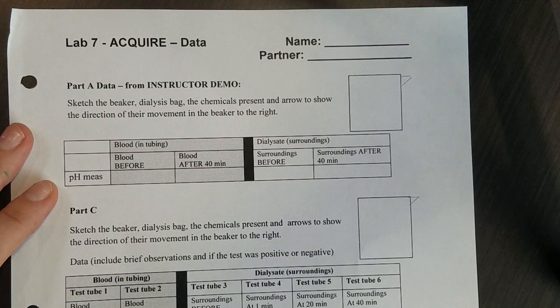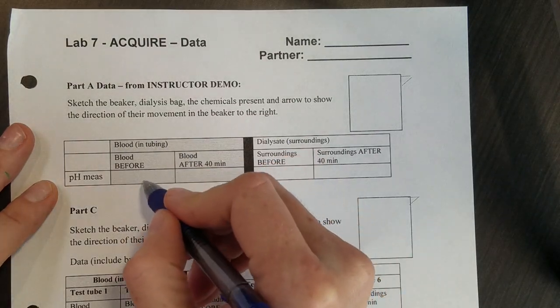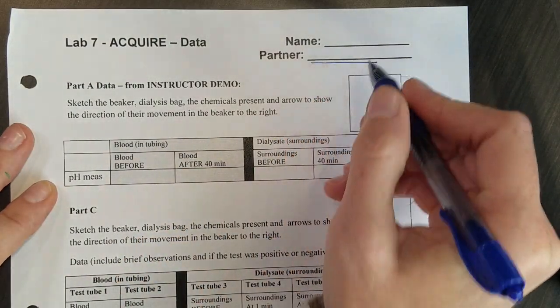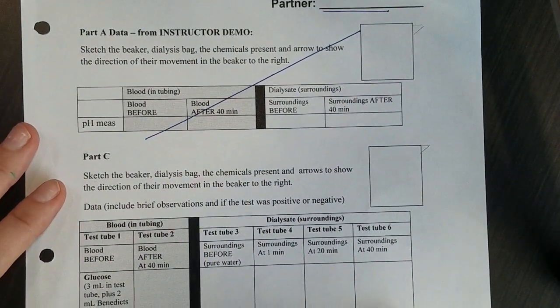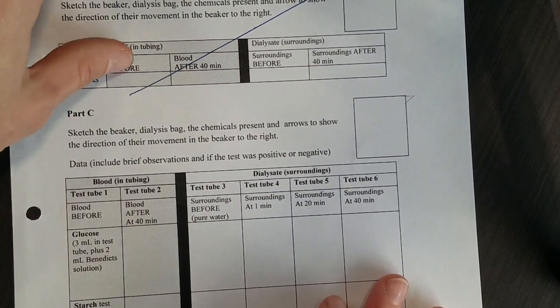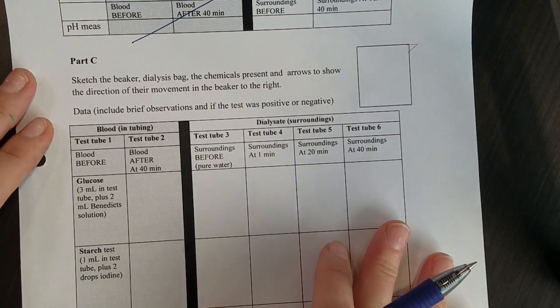Here's your data sheet. This is what you're going to turn in. If you work with somebody please write your partner's name but also write your name. We're not doing part A today but you will fill in observations for part C.